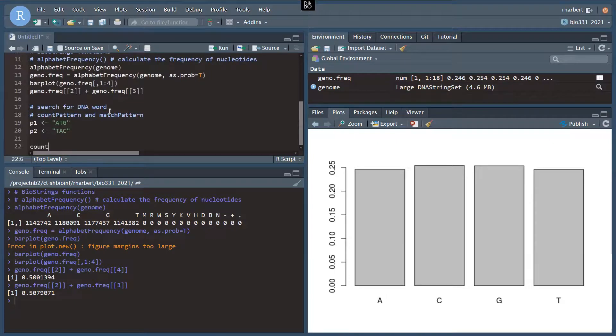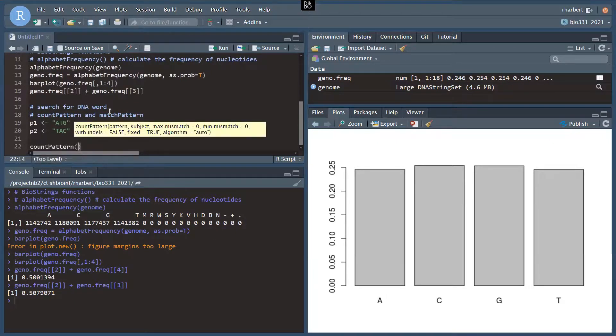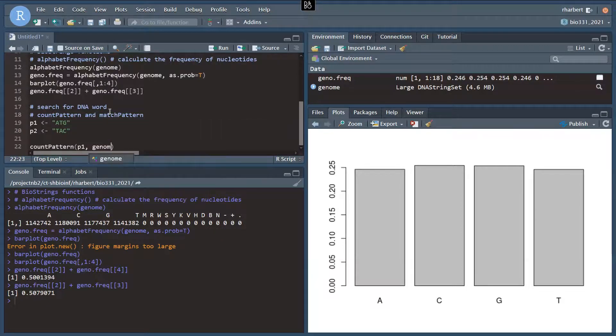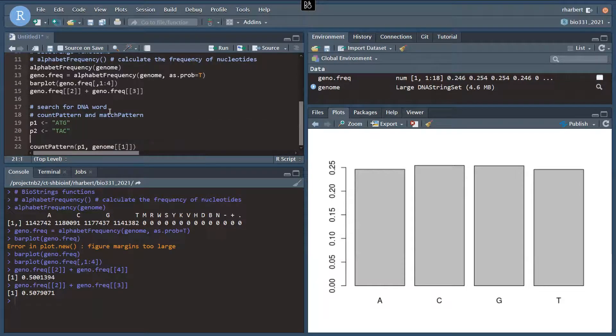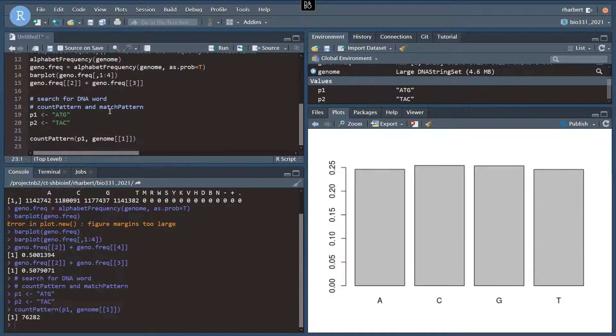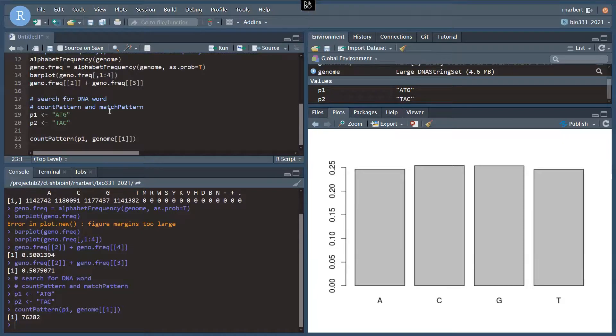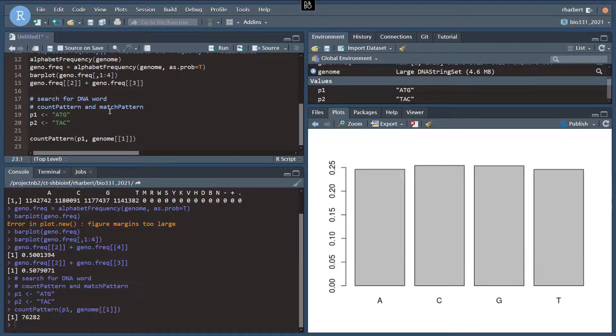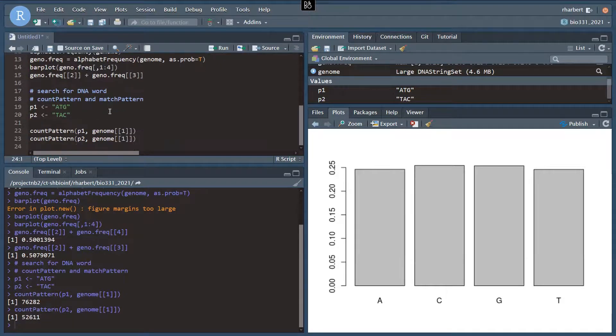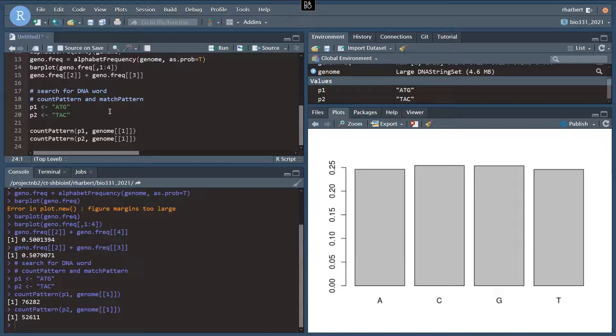All right. And we can do countPattern, pattern1. And we're searching in genome bracket bracket 1. So just the string object. And we get 76,282 matches to the forward read on that. Let's run that. 52,611 for the reverse.